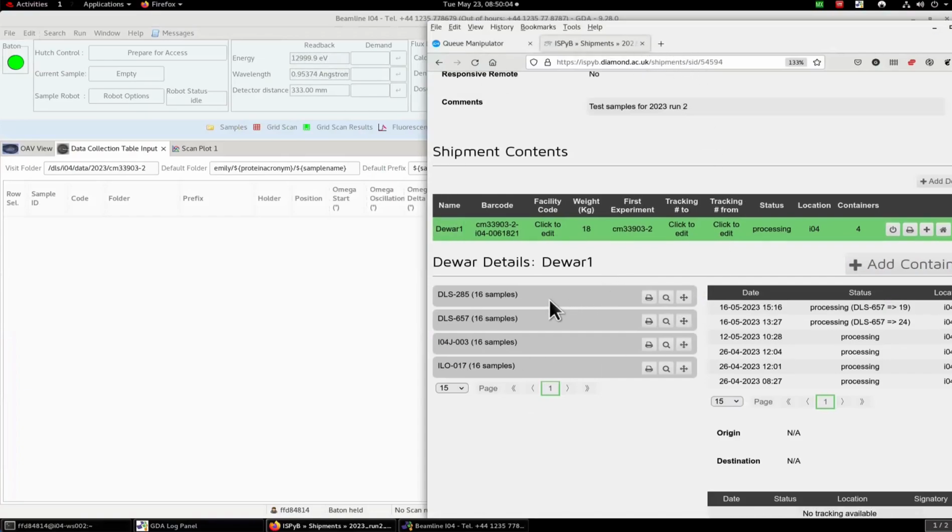That's the URL for the shipment. You will also have packs. I'm going to exemplify first with the pack, and then after with the shipment, but this would also work with the sample that I'm not going to show. So essentially what we need is this ID over here, but you can just grab the whole URL. Let's try with the pack.